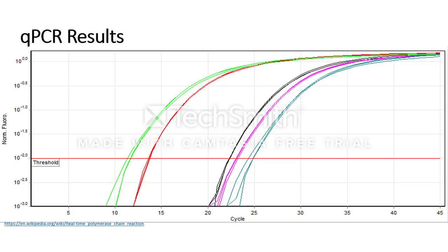The number of DNA copies in a sample can be analyzed once the threshold value is reached, which can be useful in diagnostic tests, for example when trying to detect the presence of metastatic cancer genes in tissue or cell samples.